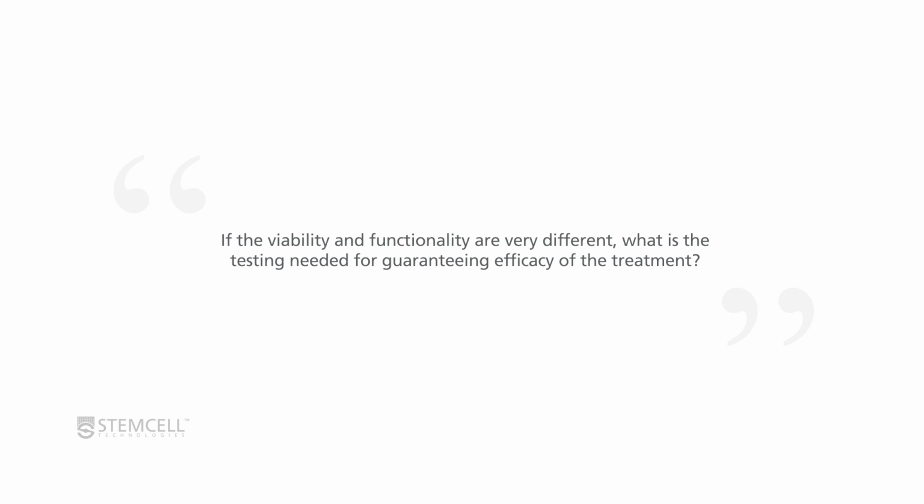48 hours. We don't actually allow anybody to send us samples to test unless they're within the 24-hour window, so recognizing that. But to really test for functionality and not just viability, viability is always just a DNA stain. You have to incorporate some kind of activity, biological activity that takes place in those cells after you've thawed them or after you've manipulated them.